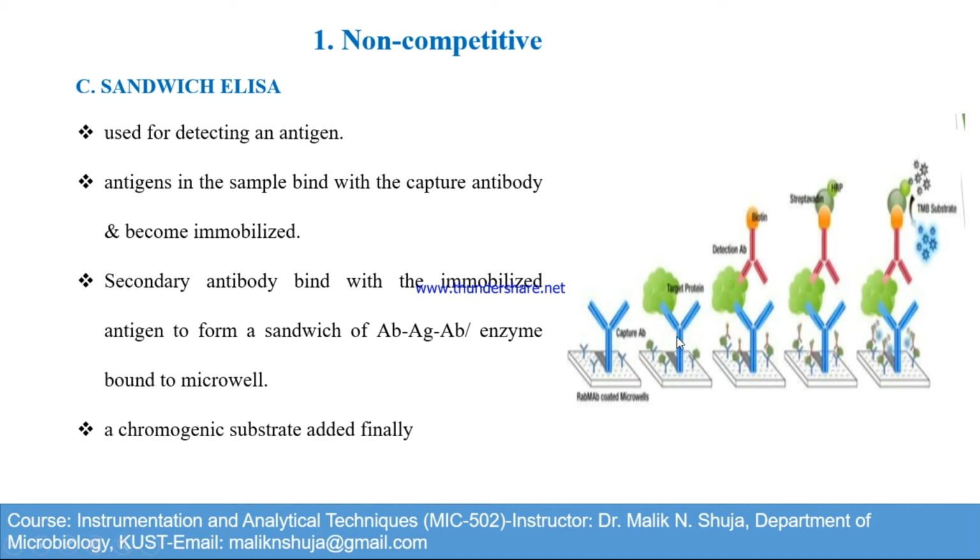Here we can see that wells are coated with the capture antibody or monoclonal antibody. When antigens are applied, these antigens are specific to these monoclonal antibodies, so they make a complex. Now we have another antibody, known as the secondary antibody. When we apply the secondary antibody, it binds here. The secondary antibody is linked with another enzyme.